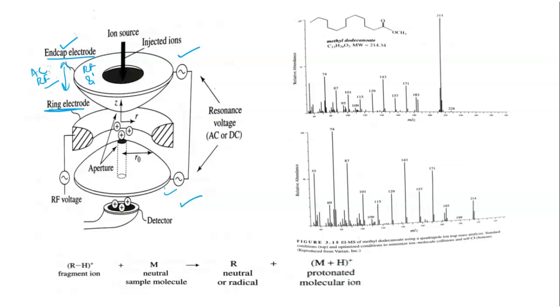So that is why the name, that is your quadrupole ion trap mass analyzer. Now what is the thing that you are going to do? That is sweeping your radio frequency potential. It will result in the removal of your ions with increasing mass by charge values. As you sweep the RF potential, even slightly, it results in the removal of ions with increasing mass by charge value by putting them in unstable trajectory. Okay, and what is happening, they are now getting ejected.